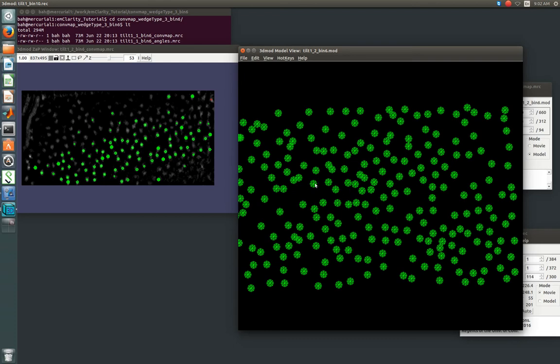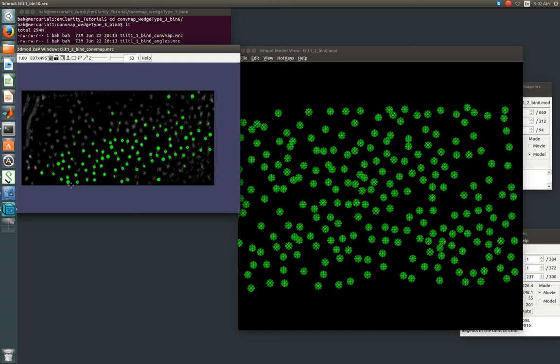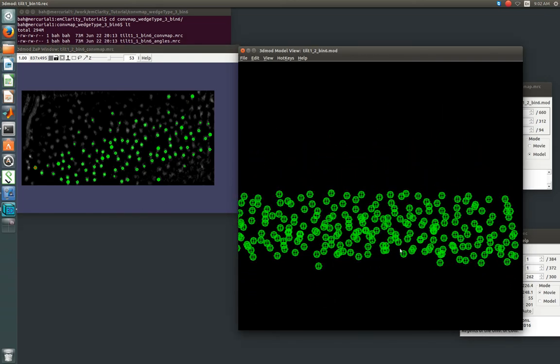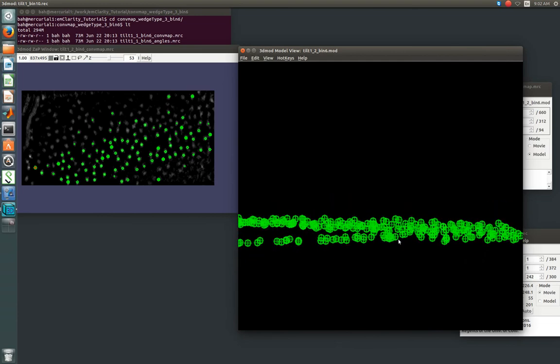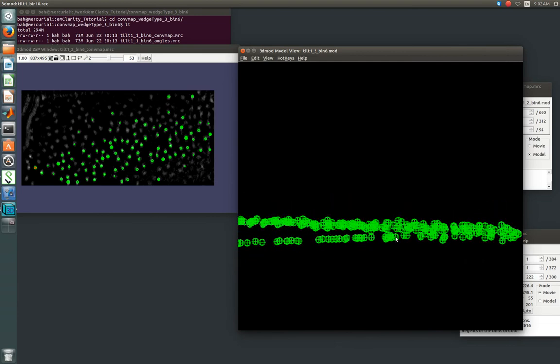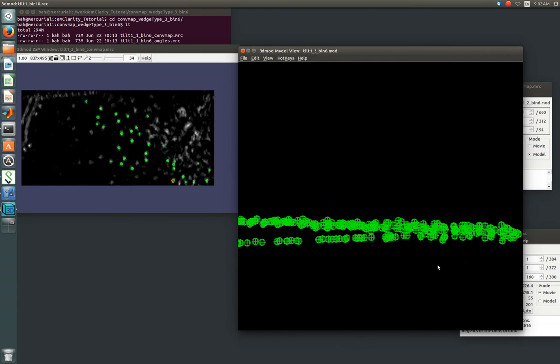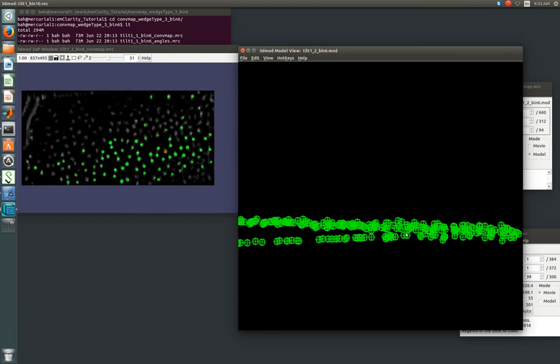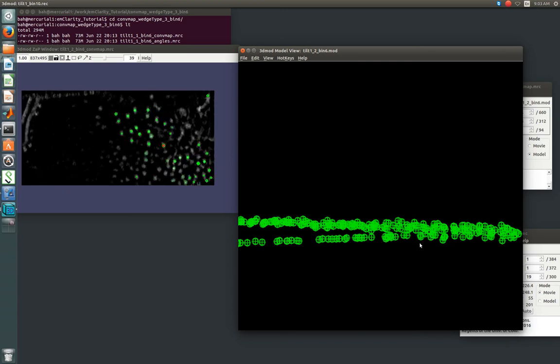And then in order to delete each of these individual contours, you can select them with the right mouse button, selecting shift D. Or if you didn't mean to, ctrl Z will undo it. And importantly, in 3D you can do this editing to select multiple contours. You first select one by right clicking, and then press and hold the ctrl key. And then you can drag your mouse over multiple at the same time, selecting many contours at once.